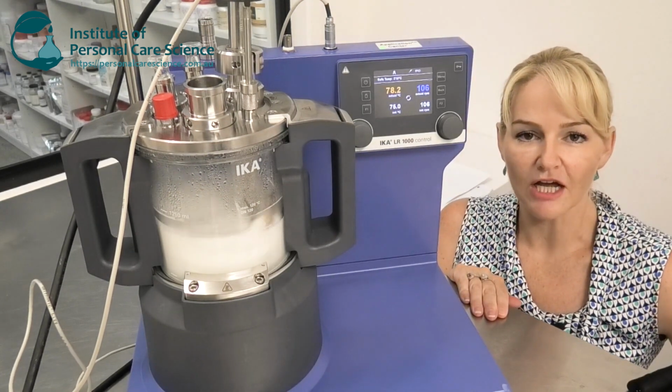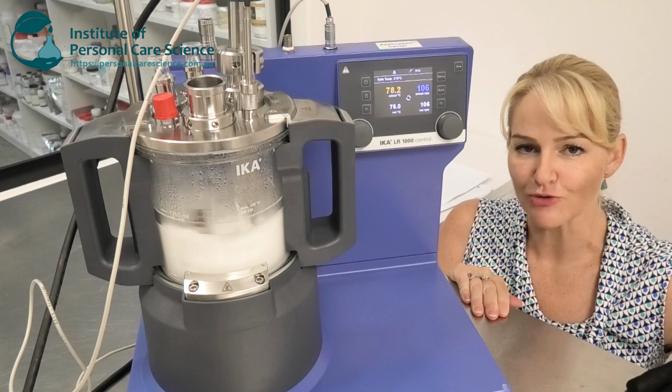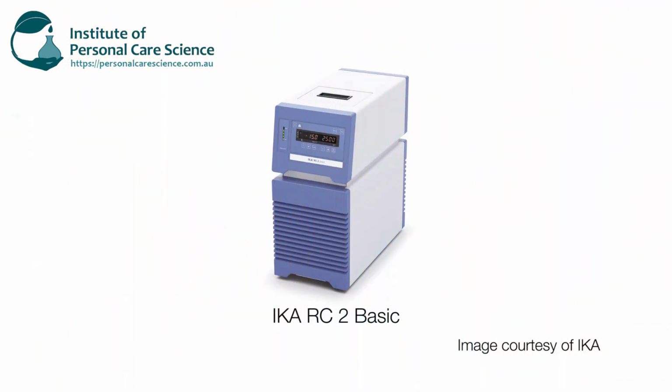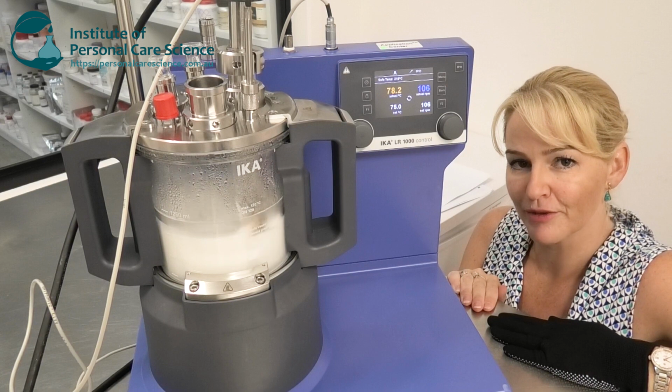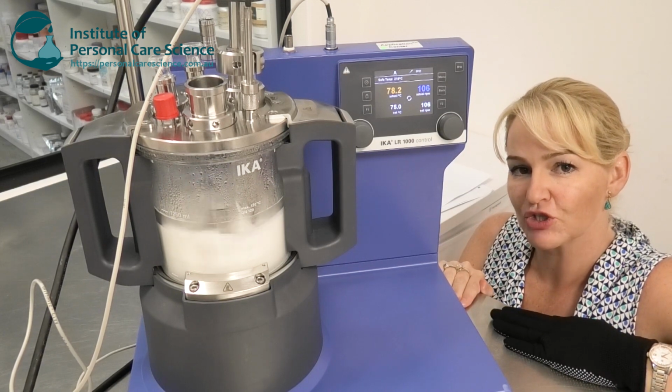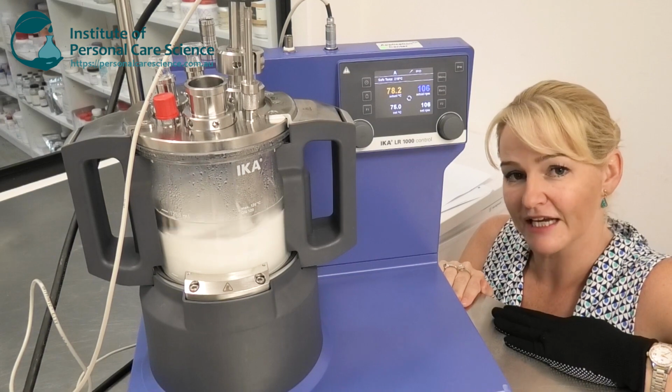Now it's almost like set and forget while it cools down. There's also a great cooling device you can add to this piece of equipment that acts like a cooling jacket, so it will rapidly cool my emulsion. I haven't got it attached to this machine, but it would still only take a couple of hours to cool completely in this lab setting.